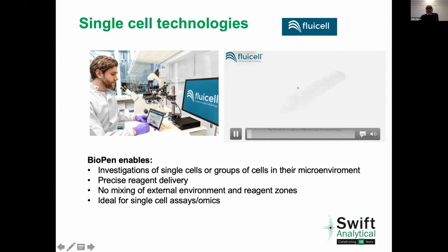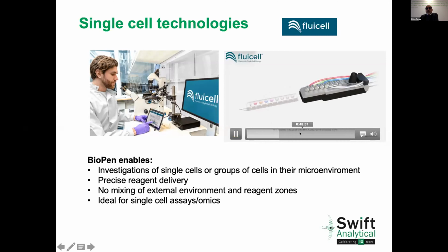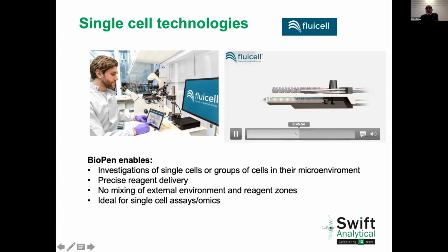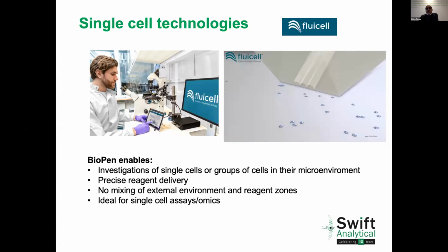This is the biopen tip. The biopen tip is the means with which we're holding the solution. It's got a flexible end, so when it comes into contact with the surface, it doesn't break. We fill in our reagents. Up to 4 different reagents can be used, and they can be of different concentrations or different types. The 4 other positions that we have are the waste positions. Once we clamp it into place, we can place it on our micromanipulator and onto our sample plate.